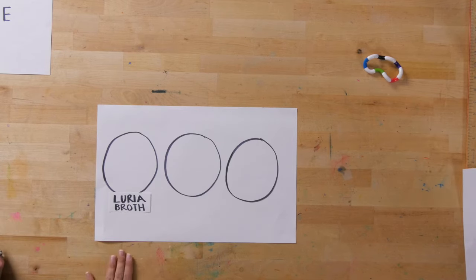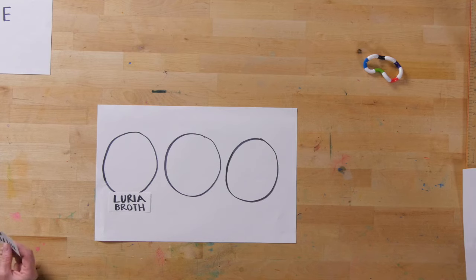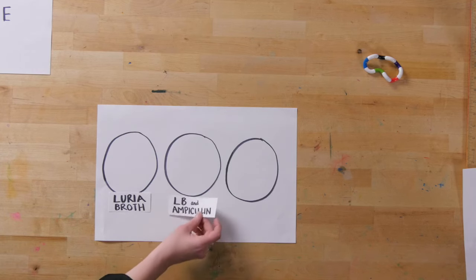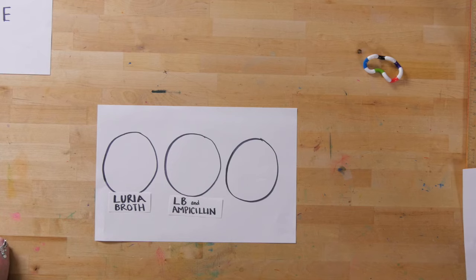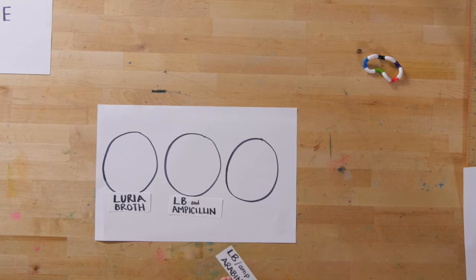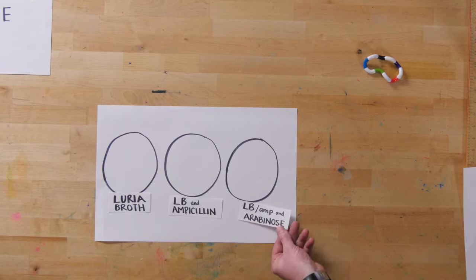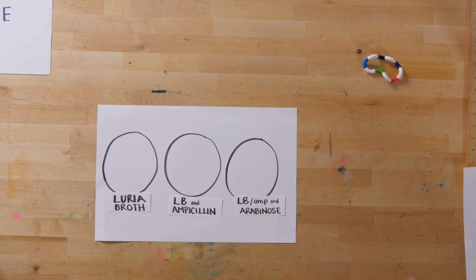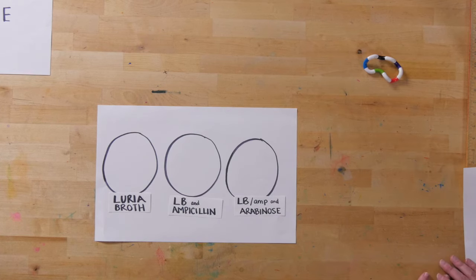The first plate has only food and things they like. The second one is LB or Luria broth plus ampicillin, which is where we actually add the antibiotic into the plate to select for the bacteria that we want. The third one has the LB plus the ampicillin plus arabinose, something that will help us kick start growing that red fluorescent protein.